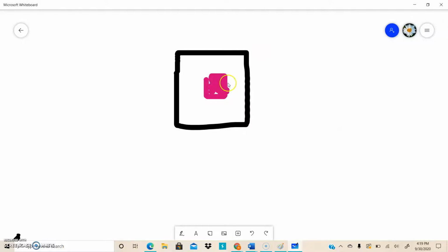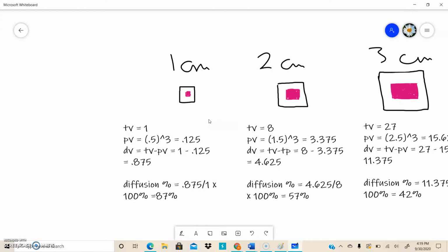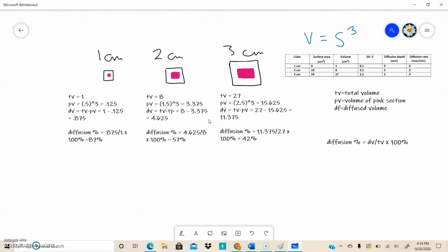Or to the section where the pink dye starts. If your cube was completely clear, your depth is from the edge to the very center of the cube, okay? So it should be around 5. If it's not 5 exactly, that is perfectly okay.